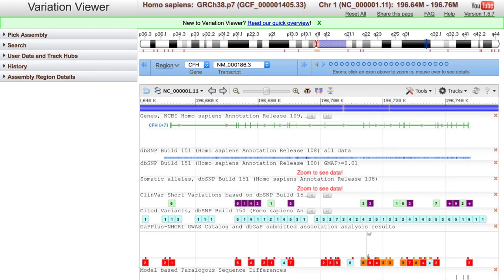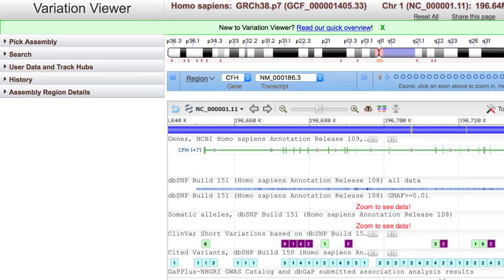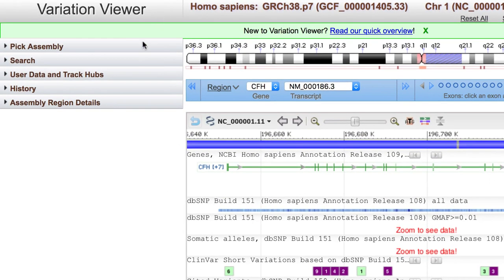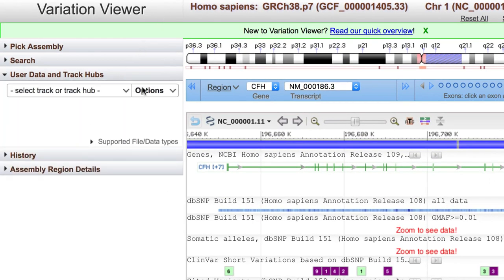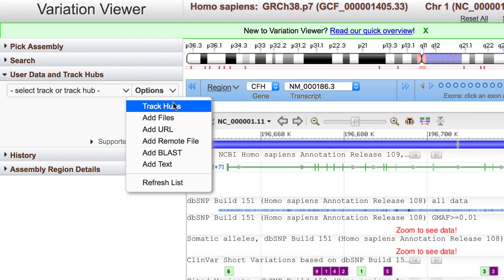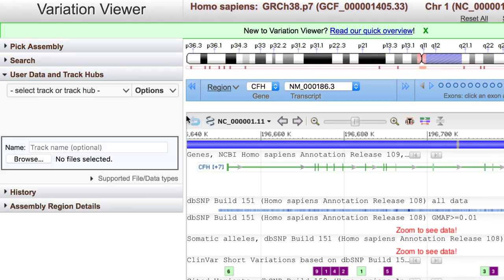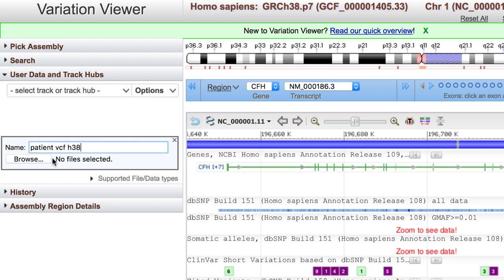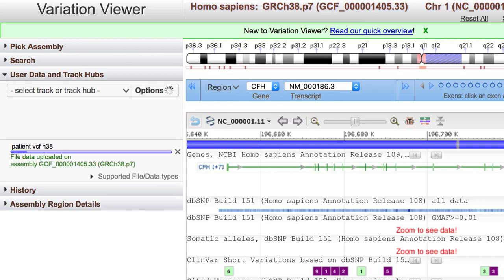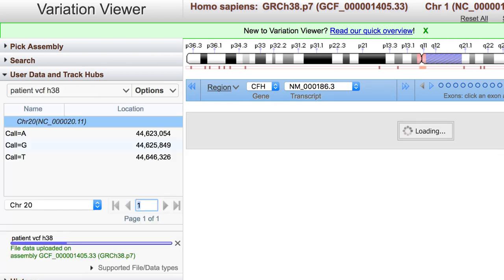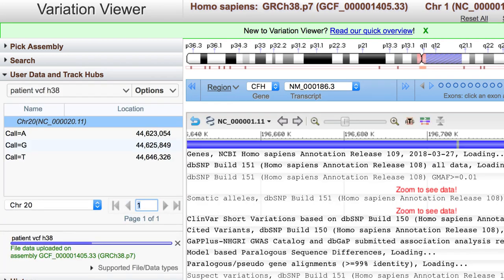Now let's load the VCF file for GRCh38. In the User Data and Track Hubs widget, open Options and select Add Files, since we have a local copy of the file. You can name the track if you want, then browse to your file, and the selected file will be uploaded.